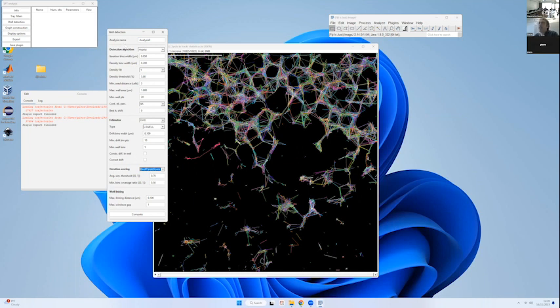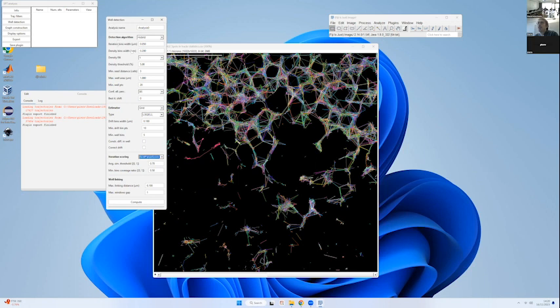David presented a bit the different algorithms. So basically this interface implements all of the algorithms. For the sake of doing things quickly, as an example, we're just going to run the plugin directly and just use these default parameters. They kind of make sense. They are not super optimized.